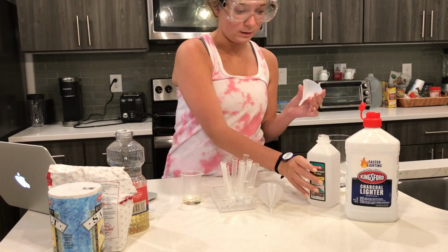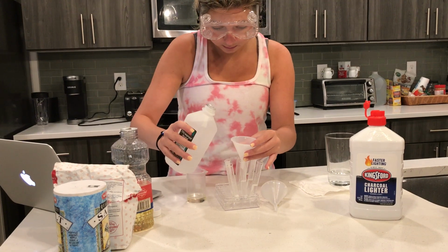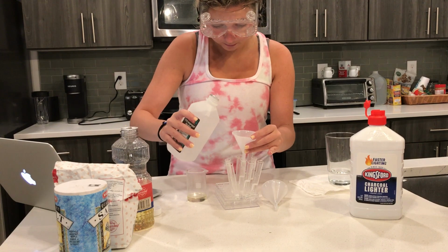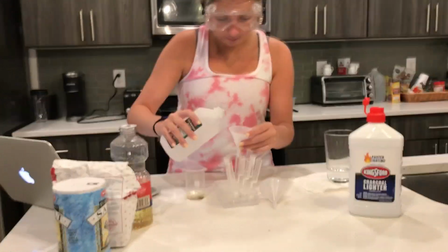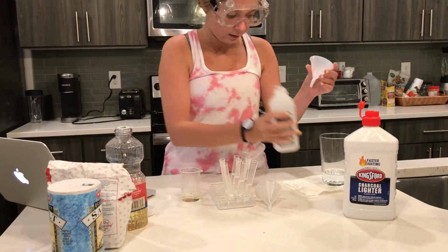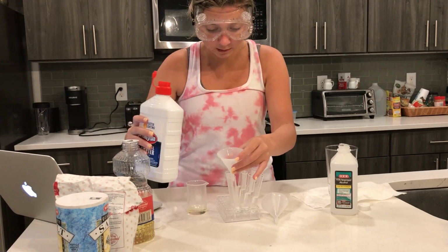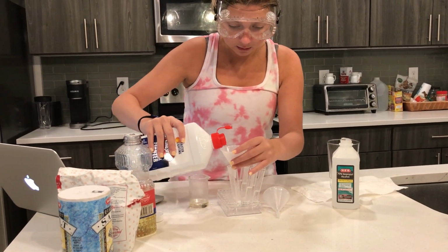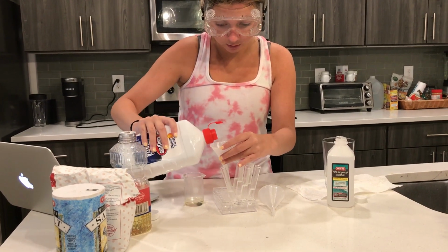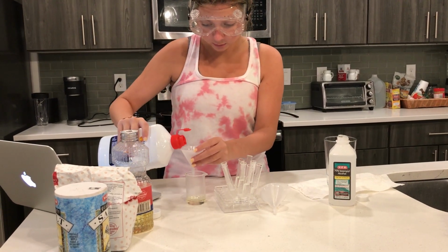Okay, and now I'm going to do my alcohol. So first in the salt, and then the sugar, and then lastly my oil. And then lastly I'm going to do my lighter fluid. So first in the salt, and then the sugar, and then I'm going to put some in the oil.